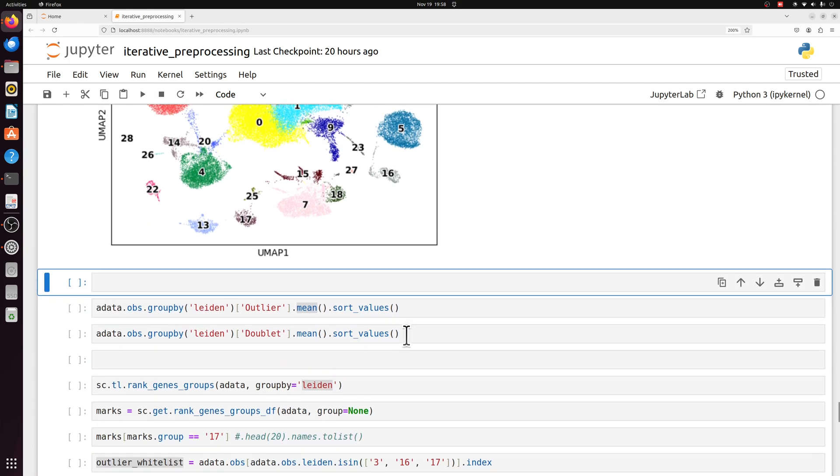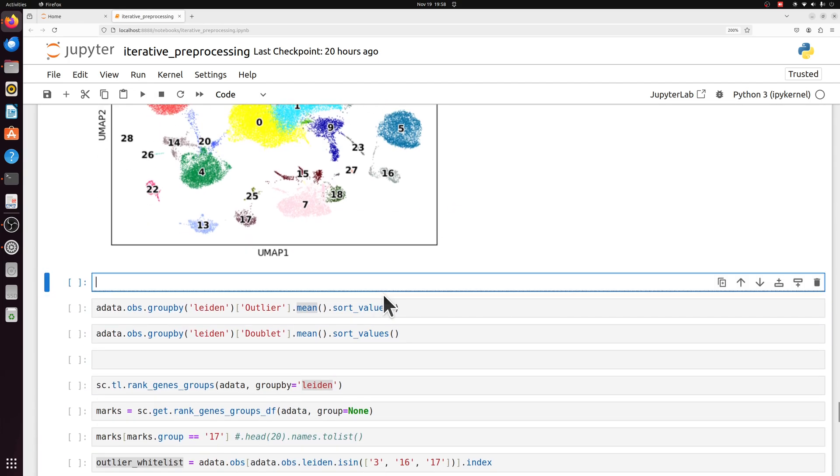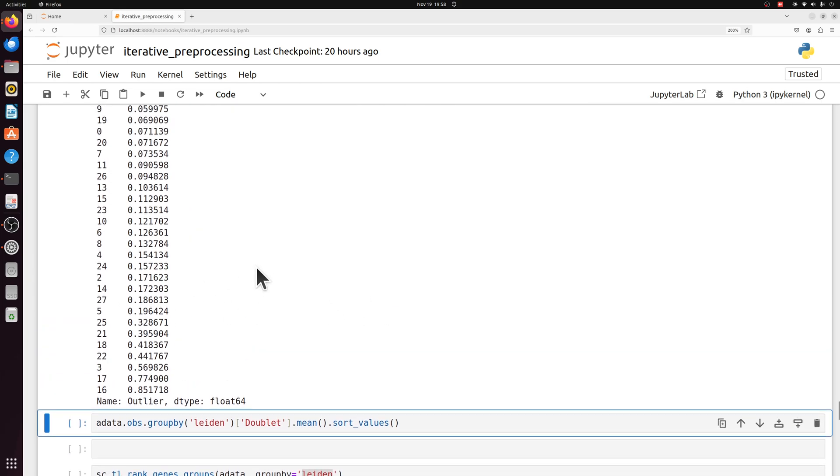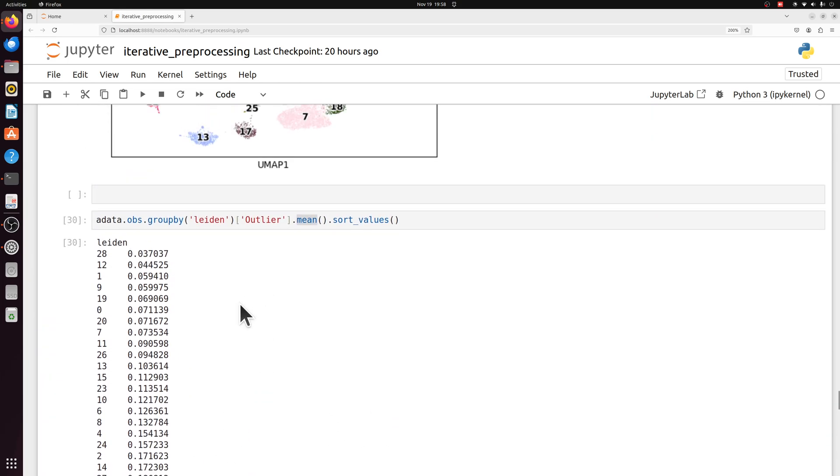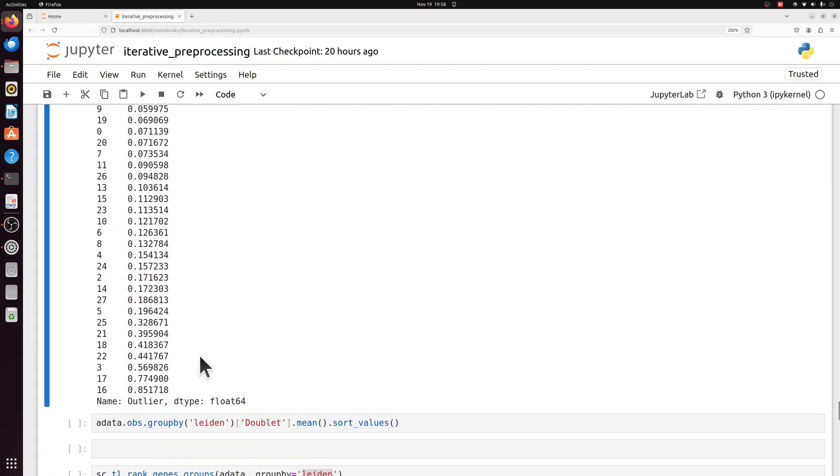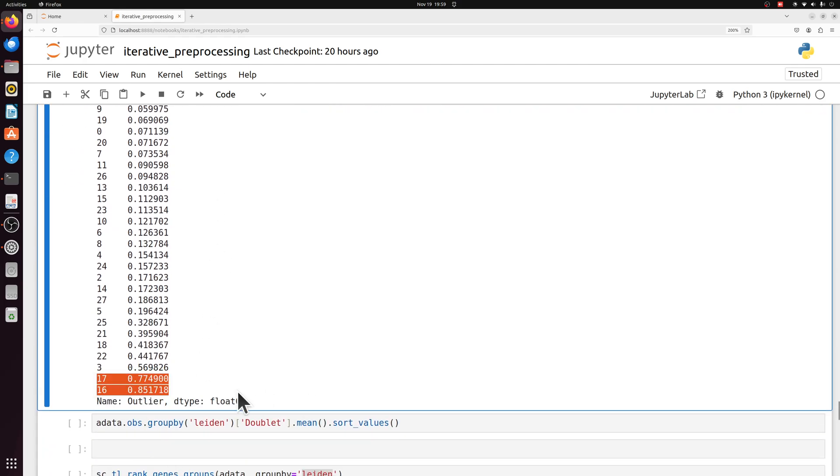Instead of just subjectively looking at a UMAP, we can also plot the proportion of outliers in each of these populations by just plotting the mean of each Leiden grouping based on that outlier column. And the outlier was true or false, so 0, 1. So if you plot the mean of 0, 1, you get the proportion of 1s, or the proportion of outliers in this case. We have around 80% for 16 and 17, and around 60% outliers for 3.